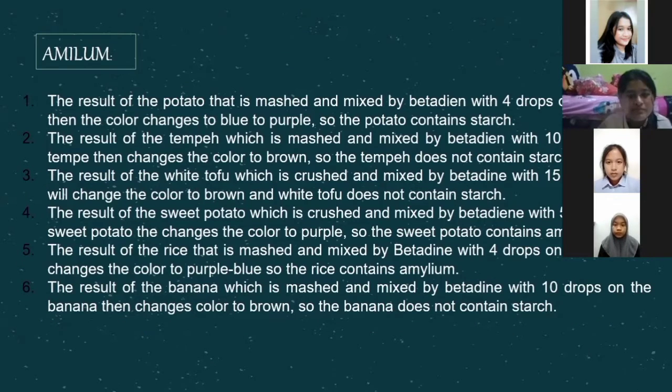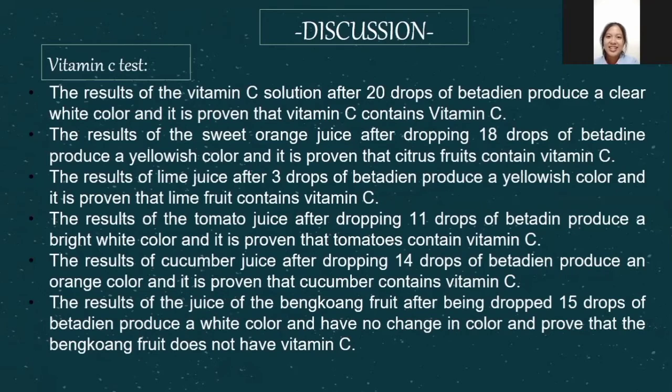Okay, next, Tania will explain about our discussion. Discussion. Vitamin C test.